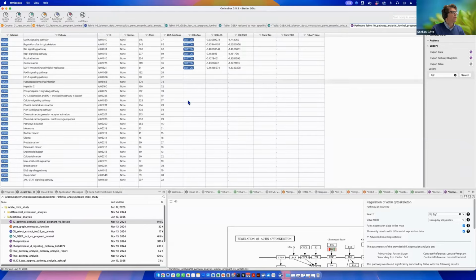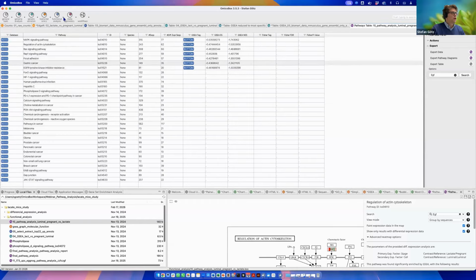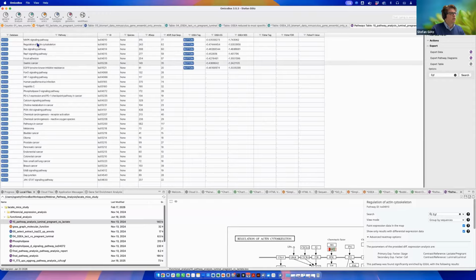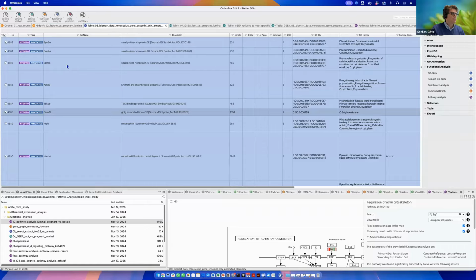So I didn't really show the nematode dataset a lot. In terms of the pathway analysis, it's kind of similar. Maybe the big difference is that you had to run through the whole annotation process of your novel transcriptome. So you were not able to just go into the load data from Biomart to get your annotations, but you had to generate them from scratch, and you had to make sure that your IDs used in your pairwise differential expression analysis do actually map to the annotations here.